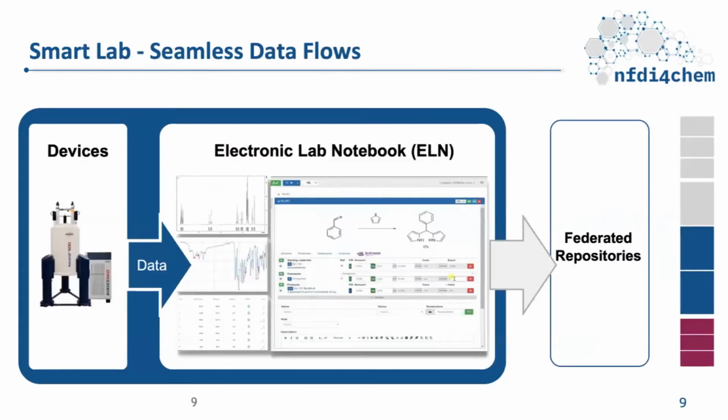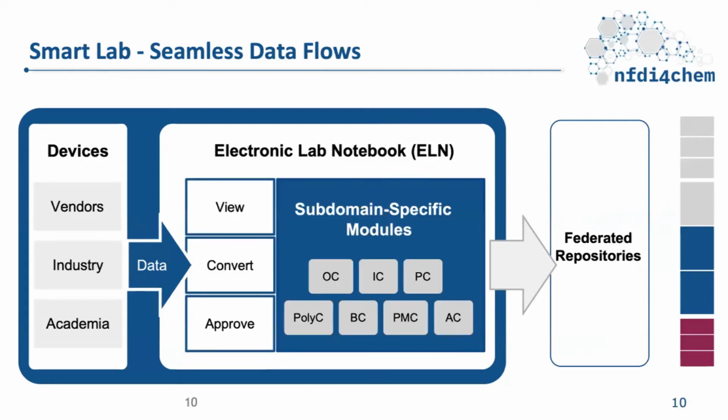So in the big picture, the devices generate all the data, wherein the electronic lab notebooks come into play in order to capture all the data, and ultimately the data will be pushed into federated repositories. And then we have the data from different vendors, industries, and academia being able to convert it, and the electronic lab notebooks should be able to capture all the subdomain specific modules, and then ultimately push the data to the federated repositories.